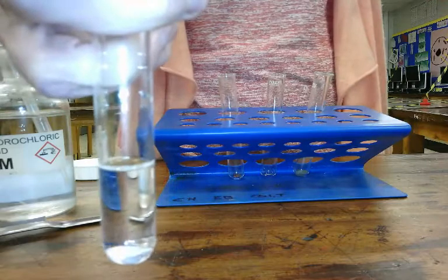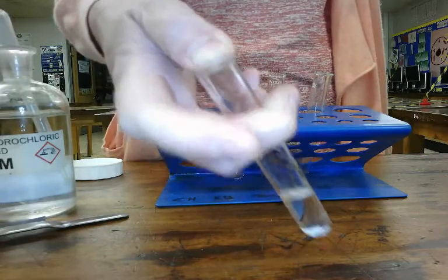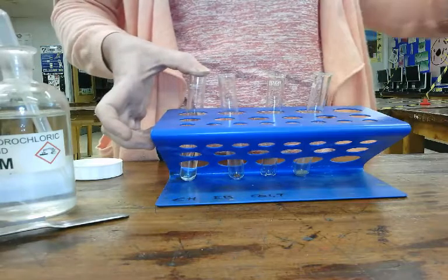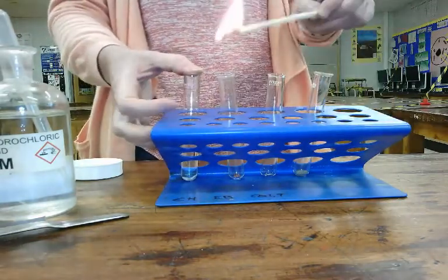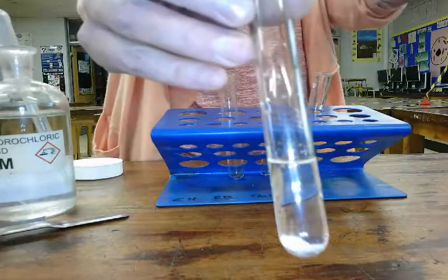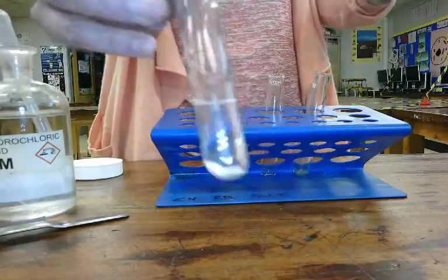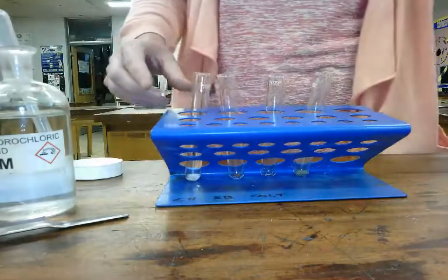I've got a Bunsen burner set up out of shot. And what I'm going to do is put the tube back into the test tube rack, come over with my splint, hold it above, nothing happens, but it is fizzing. So observations, fizzes, but no pop. And I'll come back and explain what I mean by that in a minute.